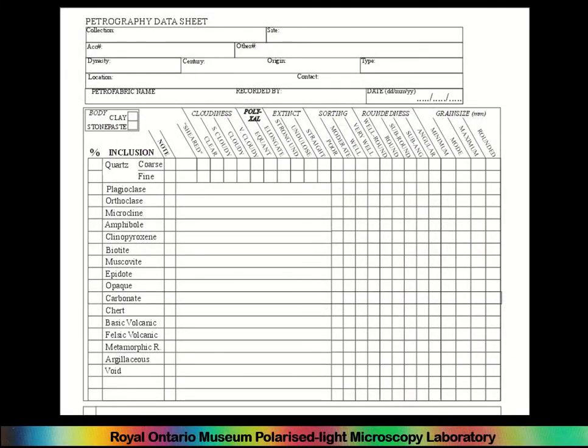So now you are capable of doing all of this. Thankfully for you, the first lab will not have all these minerals, it'll only have two of them. It'll have carbonate and quartz, which you'll easily be able to distinguish, and so you'll be able to concentrate on doing things like sorting and roundedness, grain size, and abundance, which is down here, and also doing a lovely drawing.